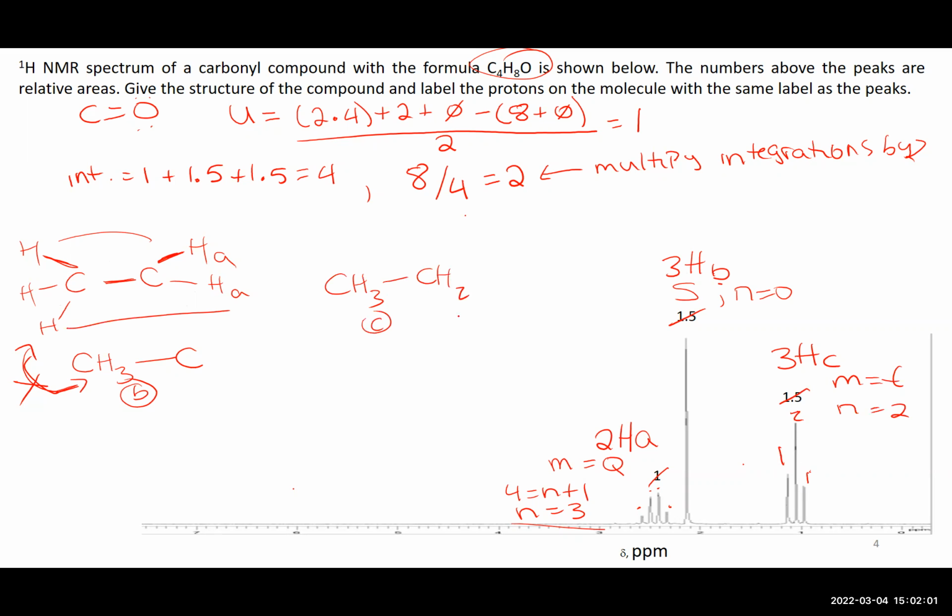Okay, so I can try and put all the pieces together. I know I have a carbonyl. I have a methyl that doesn't have any neighbors, and I think I have an ethyl. So the best thing to propose here really is a ketone, right? A ketone.